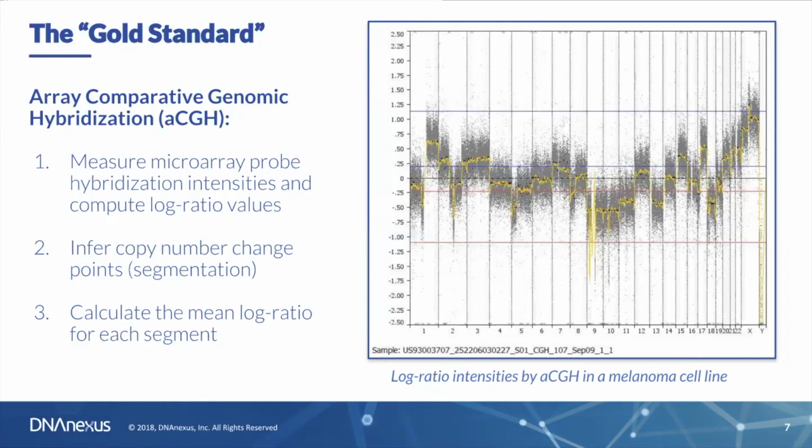of chromosome 1. And we repeat that logic across the genome, connecting these probes with similar log ratio values. And that gives us a copy number profile. Within each joined contiguous segment, we calculate a mean copy ratio, a mean log ratio, and that's something that we can report.